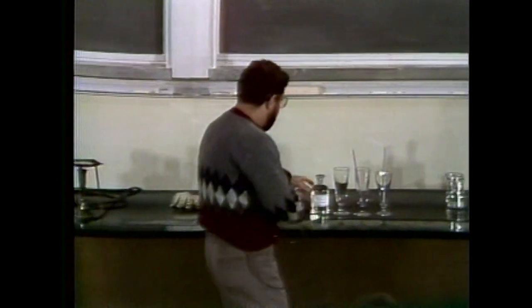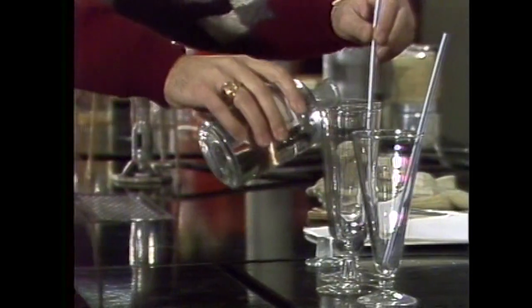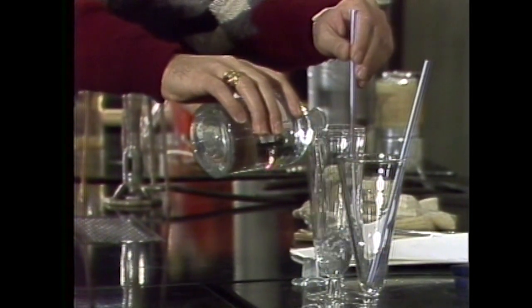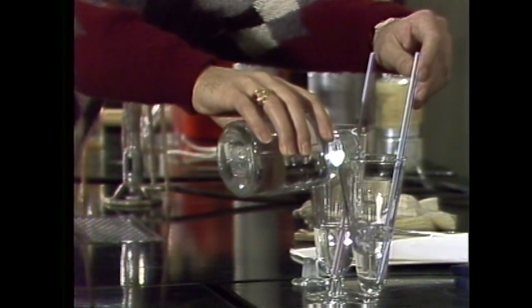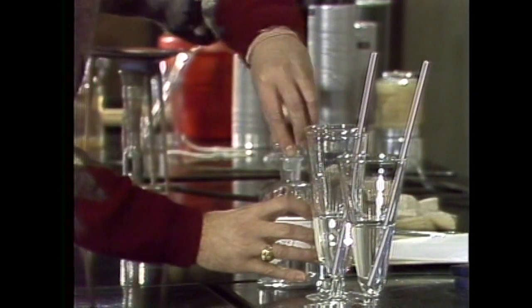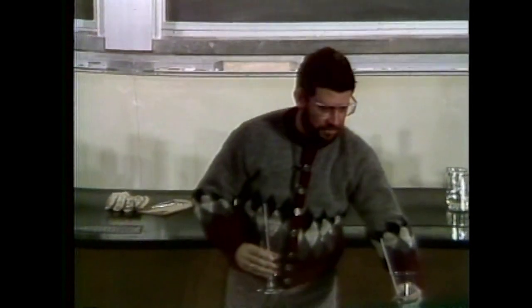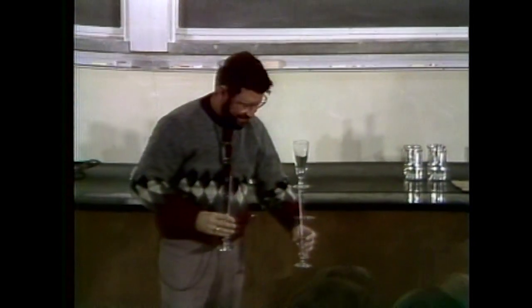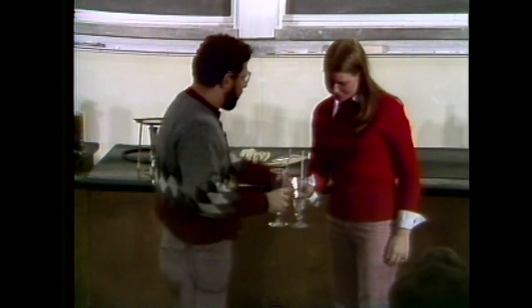What I have here is a solution of calcium hydroxide, lime water. And what I'd like to do is ask for a couple of volunteers. How about you? Would you come up here, please, and just stand over here, right where I'm standing, and then when I say go, start blowing into the solution, okay?